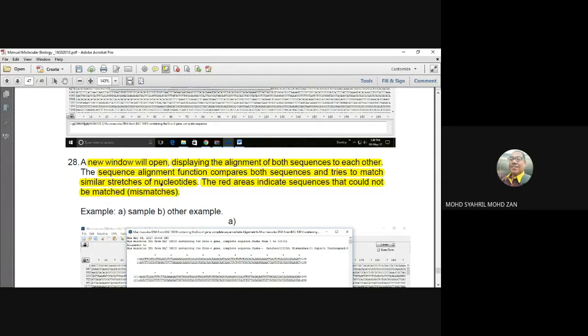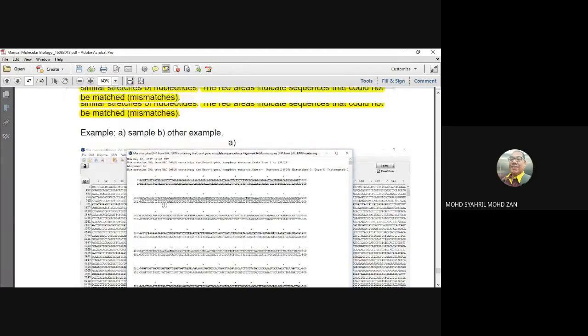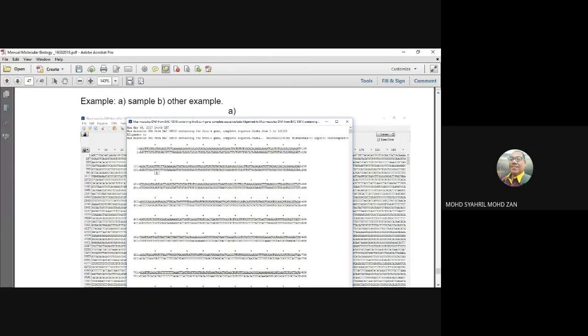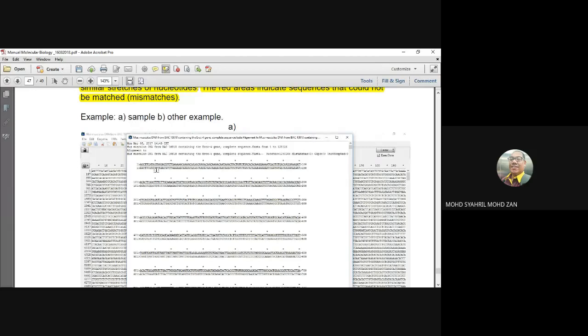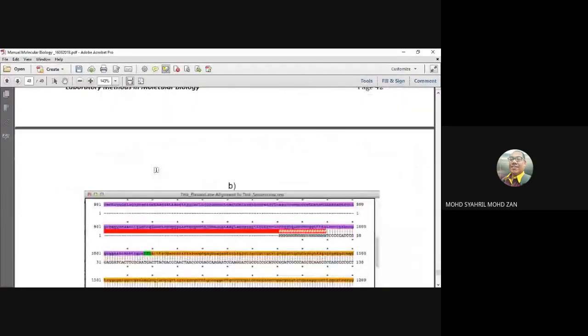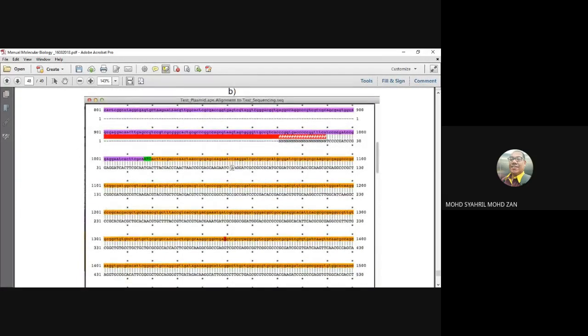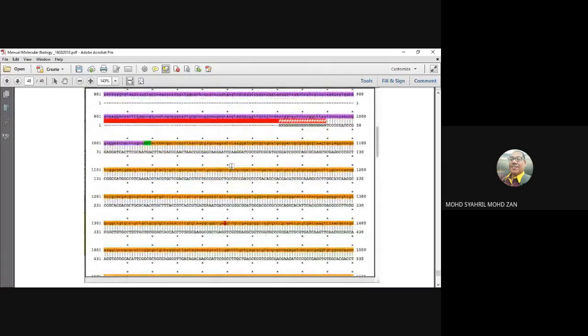Okay. So akan dapat gambar rajah, dua gambar rajah ni, okay, A and B. Okay, A adalah kita punya sequence yang align dengan dua species, dua editor window tadi. Alright. So let's say yang atas ni adalah kita punya original, yang bawah tu adalah kita edit tadi. Okay. Right. And then the B is another sample. Okay, this one nampak ni. So make sure bila kita buat tu dia akan keluar warna merah lah. So bila warna merah maknanya awak dapat lah yang mismatch dari situ.